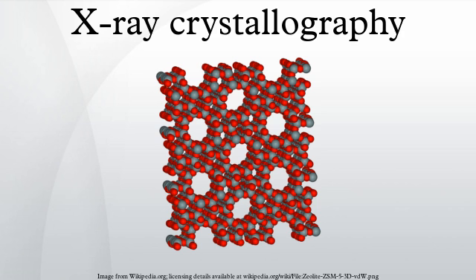The largest component of each synchrotron is its electron storage ring. This ring is actually not a perfect circle, but a many-sided polygon. At each corner of the polygon, precisely aligned magnets bend the electron stream, forcing it to stay in the ring. Each time the electrons' path is bent, they emit bursts of energy in the form of electromagnetic radiation. Because particles in a synchrotron are hurtling at nearly the speed of light, they emit intense radiation, including lots of high-energy X-rays.